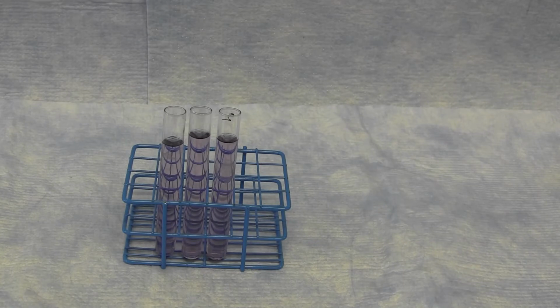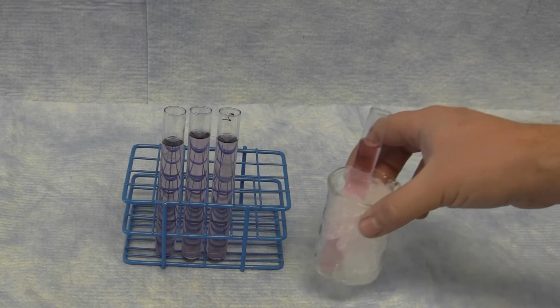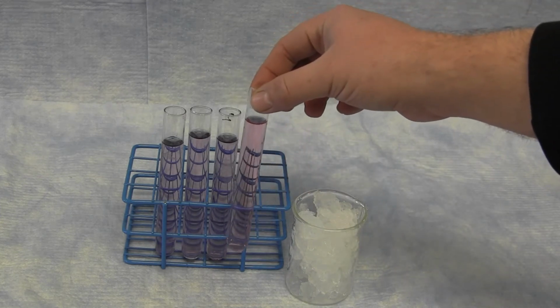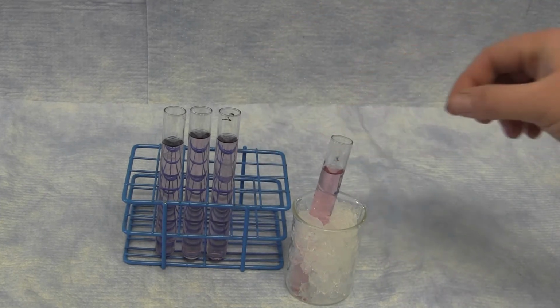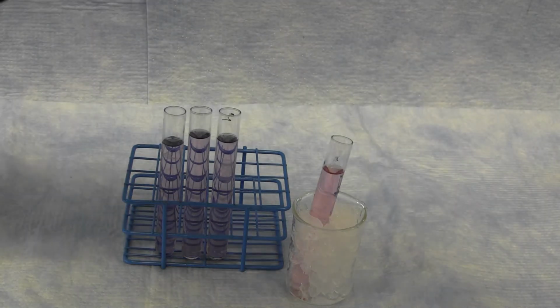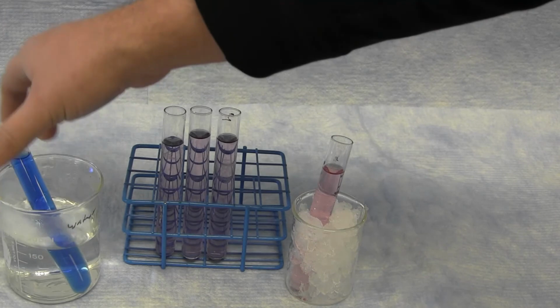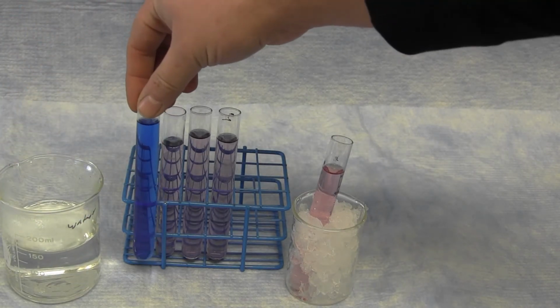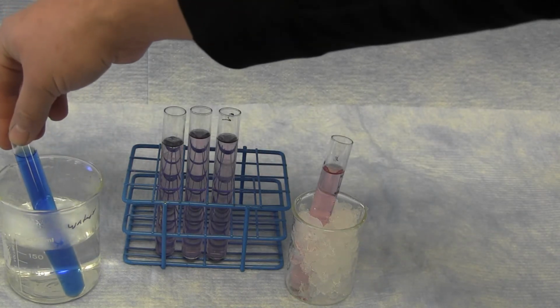With the 3 test tubes of cobalt chloride solution prepared, you will be placing one in ice and allowing that to decrease in temperature. And you'll notice the change in color as the temperature was decreased. You will also be placing one of these test tubes in a warm water bath. And you again can more predominantly see how the color changes as the temperature was increased.